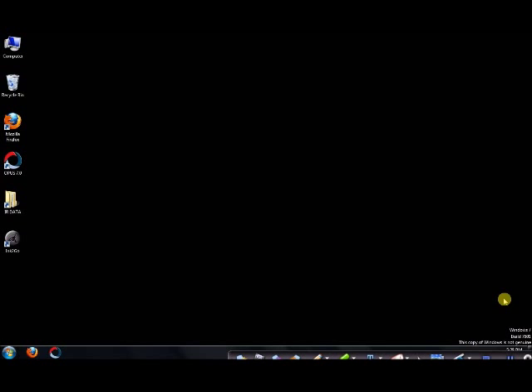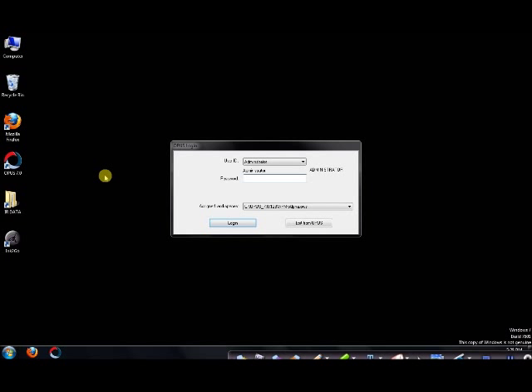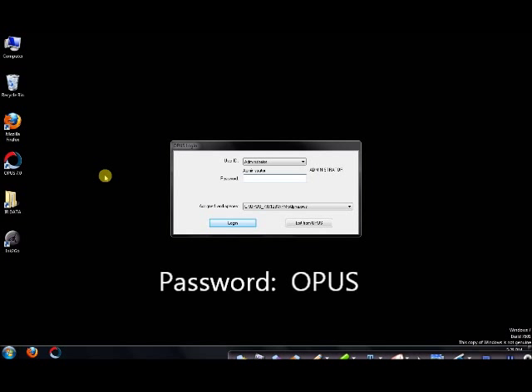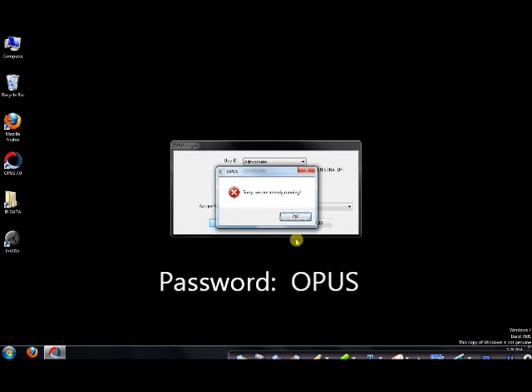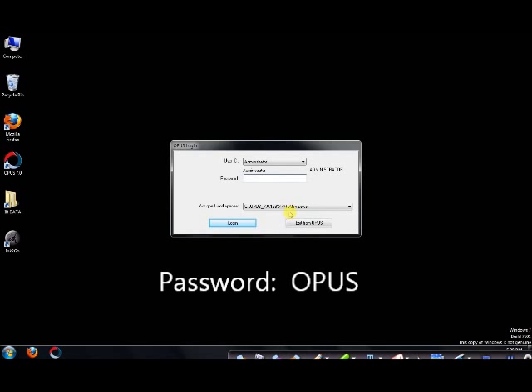On the computer desktop, you can start by double-clicking the icon Opus 7.0, after which they will prompt you for a password. You're just going to key in, in capital letters, OPUS.